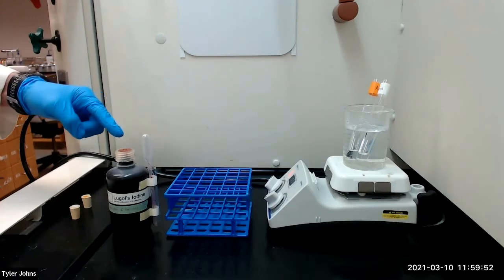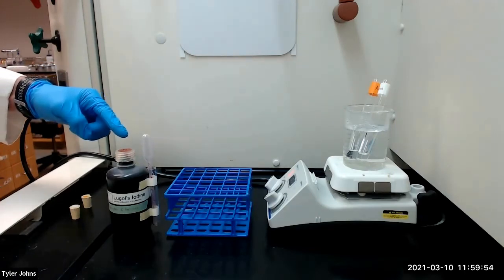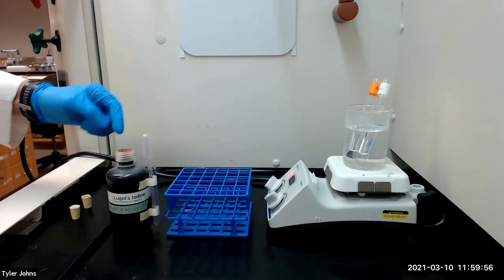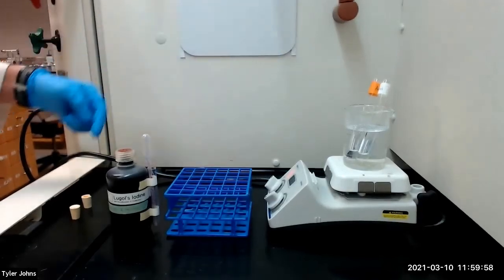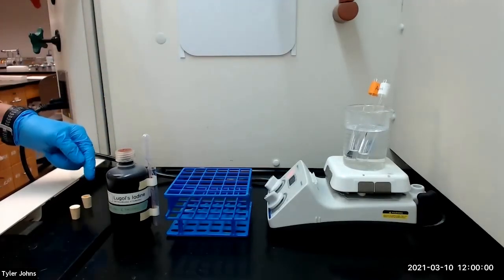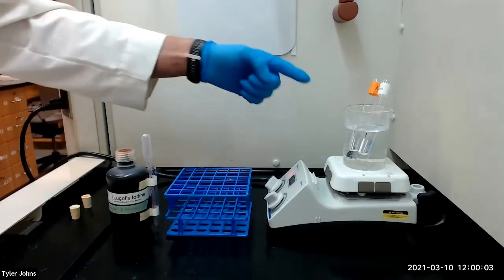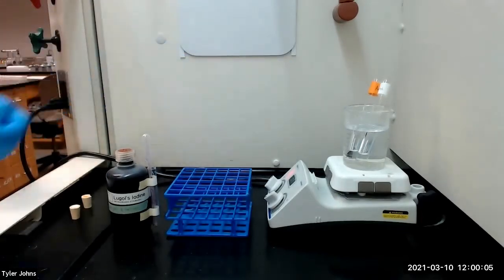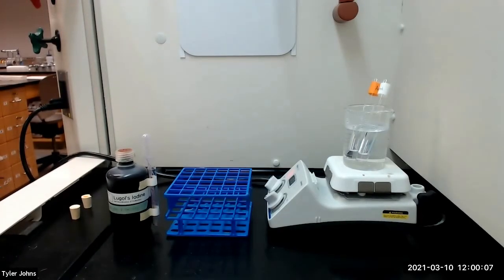We will next add four milliliters of Lugol's iodine solution in one milliliter portions to the test tubes, making sure to cork and shake the tubes after each addition of iodine. We will then heat the mixture in the hot water bath for five minutes with occasional shaking. It is likely that the dark color of the iodine reagent will be discharged.